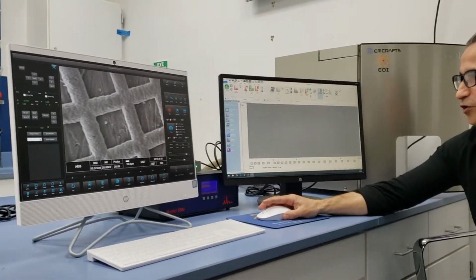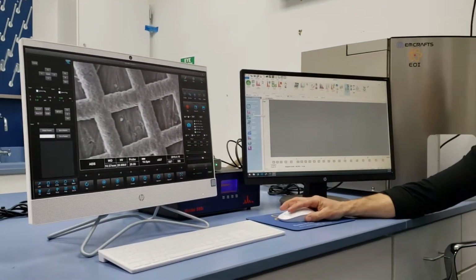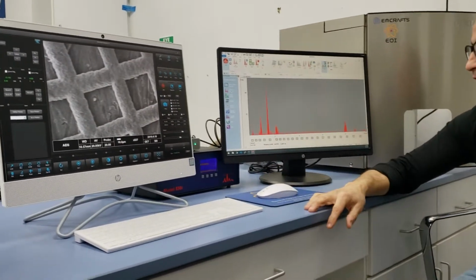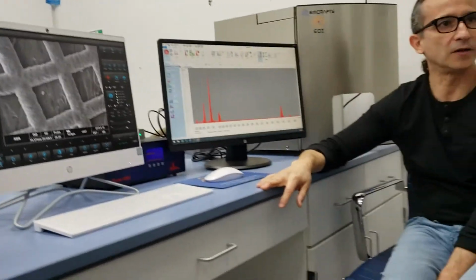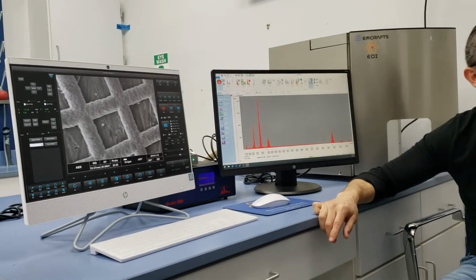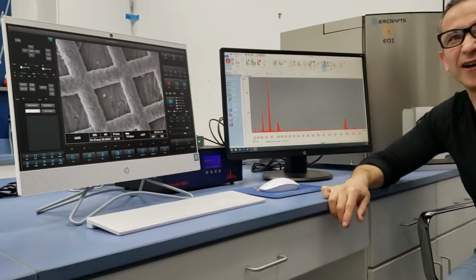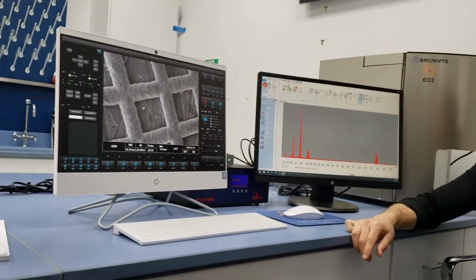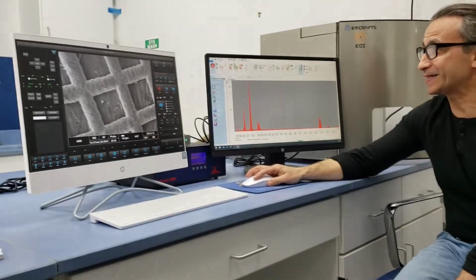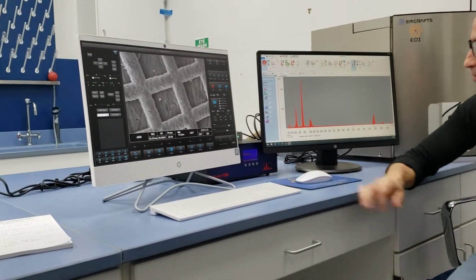So the next feature in the pull down is acquire Spectra. So as long as that beam is on, and if I hit acquire Spectra, it's going to acquire Spectra. For how long? How long does it acquire that Spectra for? Like 100 seconds. How long? 100 seconds. Is he right? Yep, he's right. All right, that's because that's what's here. The preset is 100 seconds, so it's counting 15, 16, unless I tell it to stop, or unless I change the preset and make it, say, 25 seconds, right?